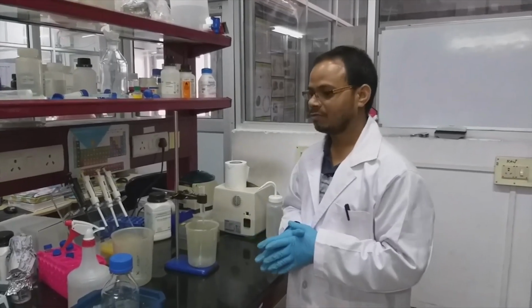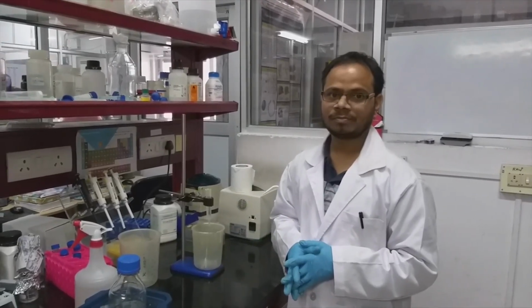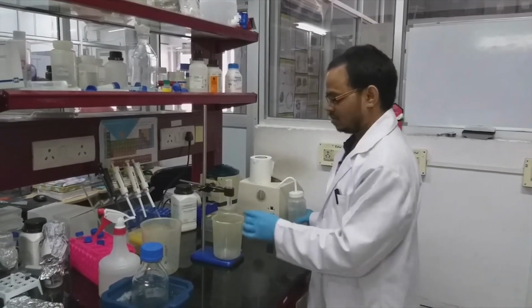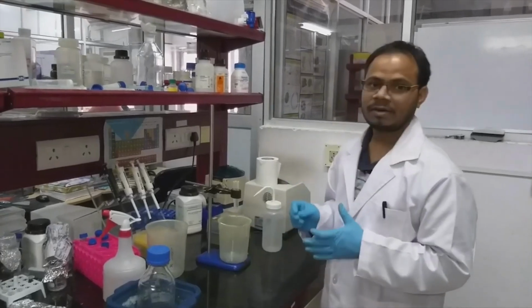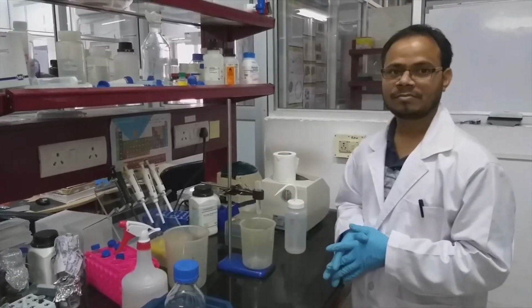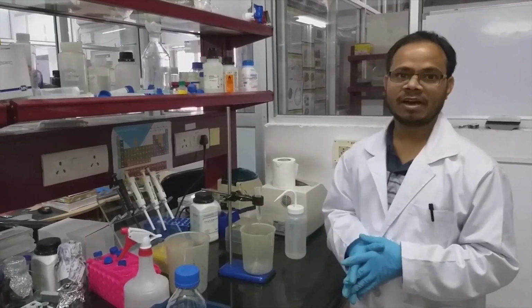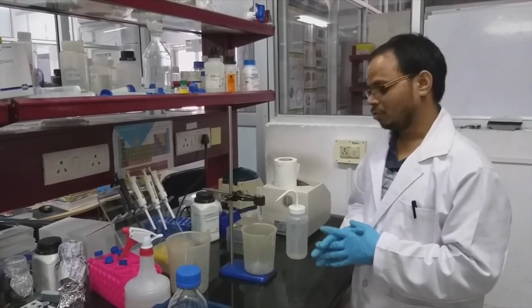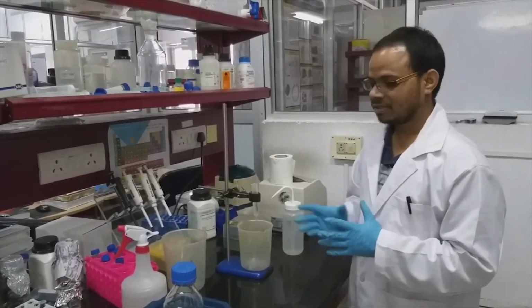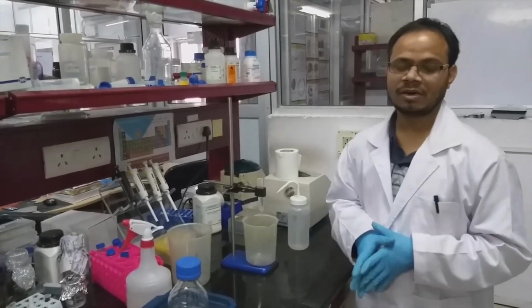So we have to wash first with water, then equilibration buffer. Let that 20% ethanol drain completely. Then we will add double distilled water. At least 5 column volumes of water should be added to remove it completely. Next we will equilibrate with the lysis buffer, the buffer which we used for the lysis of the bacterial cells.